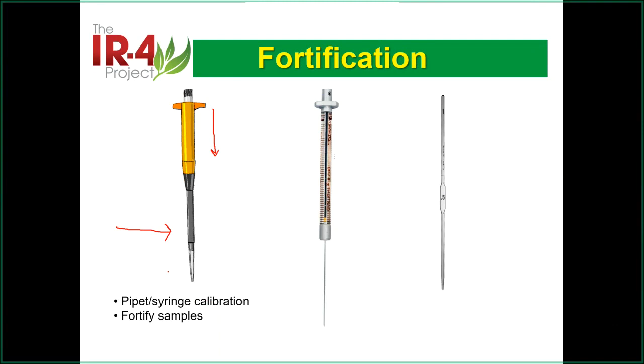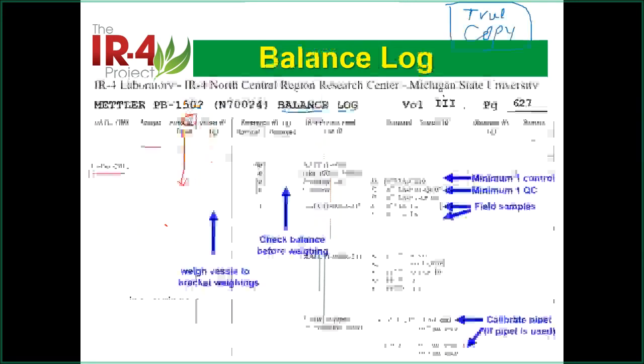You do not have to calibrate or verify it. Same thing as the balance. But the thing is, do you have data to show in your work? Because Michael did that. I need to copy his work to my data, which takes more effort. So I do it myself anyways. So I do that, which I show here.